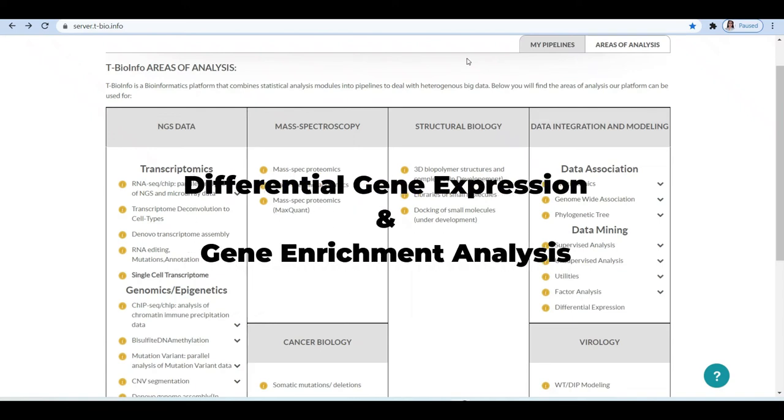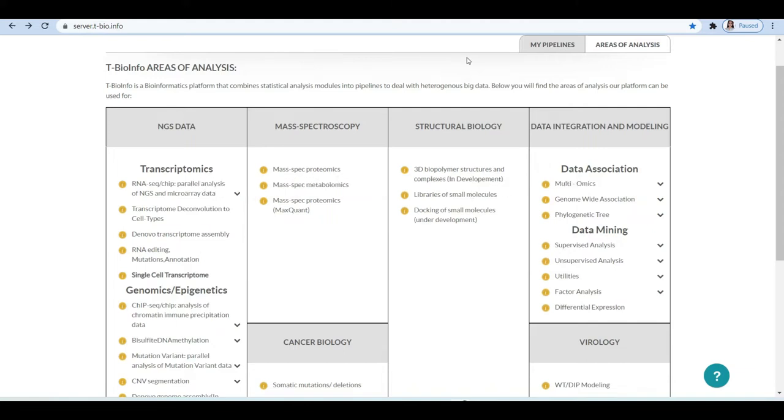Today we are going to talk about differential gene expression analysis and biological annotation pipelines. There are a number of methods and algorithms that can be applied to scrutinize the significant genes from the RNA expression data.